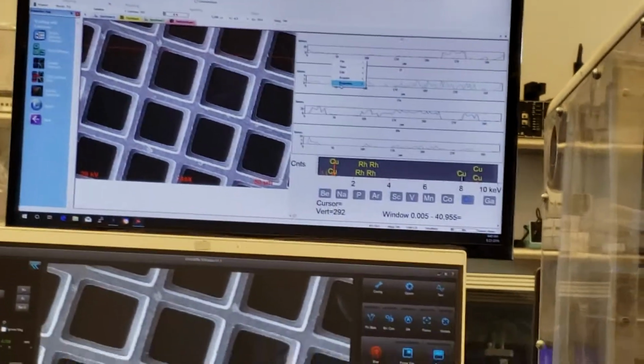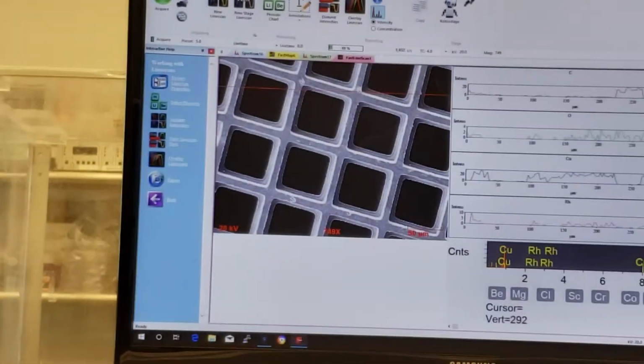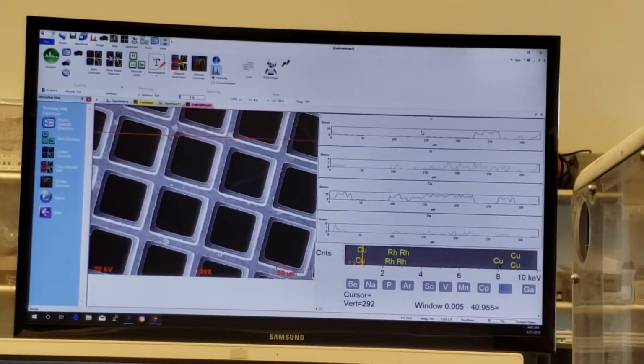So let me just right click, we'll go to its property. I'm going to change your line scan properties. I'm going to make this acquisition a little bit longer because I like this at 512. So that's going to acquire a lot longer, so that is the default. I like that better, great. So that's going to take a little bit longer.